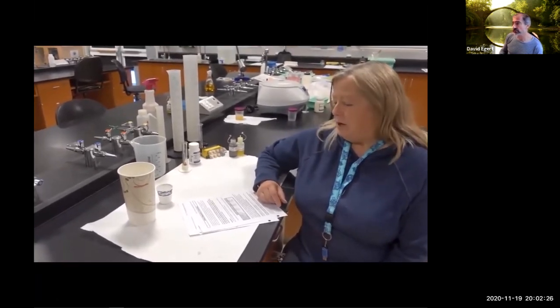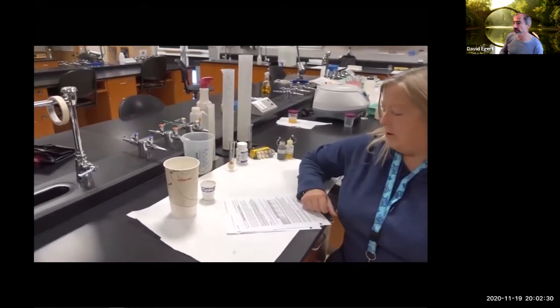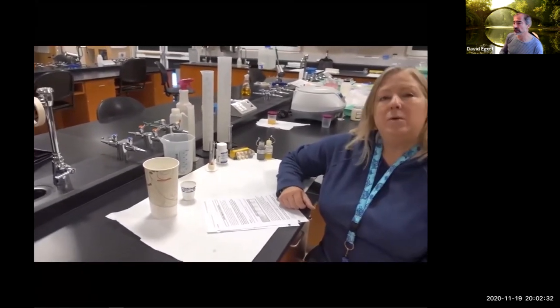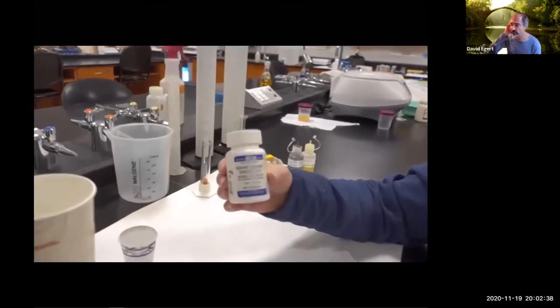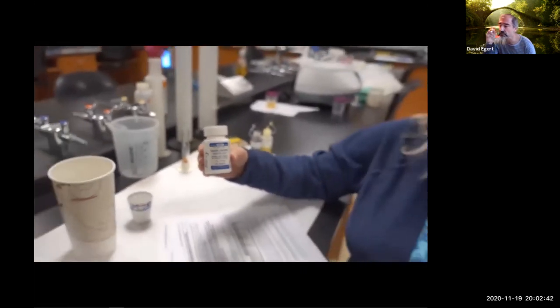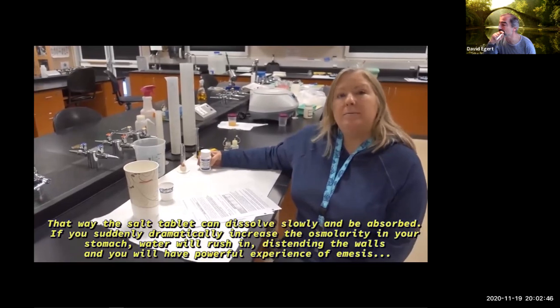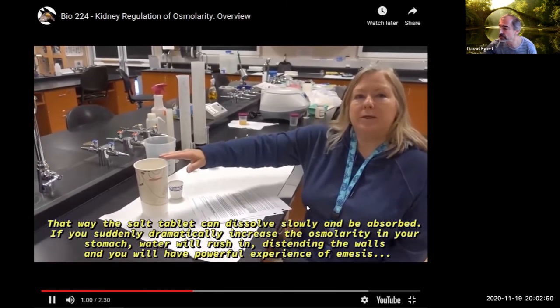Group 2 is going to also drink 800 milliliters of water and consume 1.5 grams of salt. And here we have salt tablets. Each tablet is 1 gram. So those students would take 1.5 tablets, and they should swallow them and not chew them. And they have plenty of water to swallow them with.